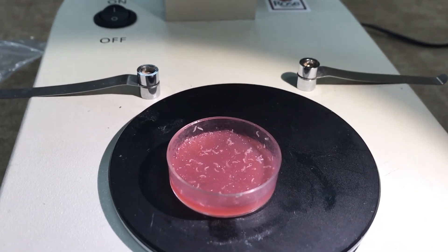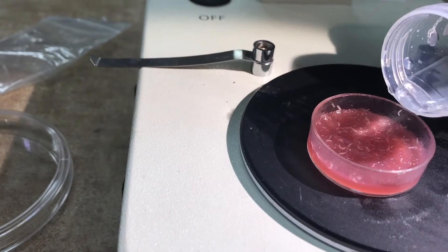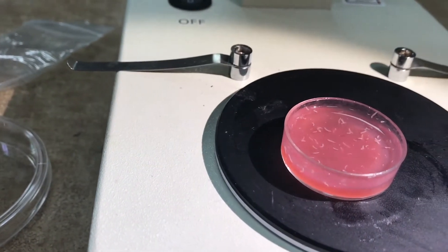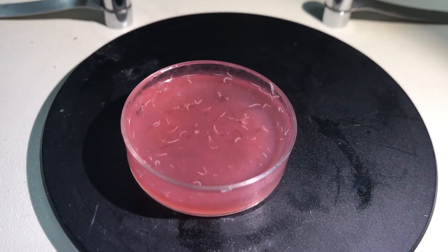So the first step is taking your petri dish with your embryo and add a little bit of sucrose solution, something like that. So take your petri dish, then you add a little bit of sucrose solution. The sucrose makes the larvae float.